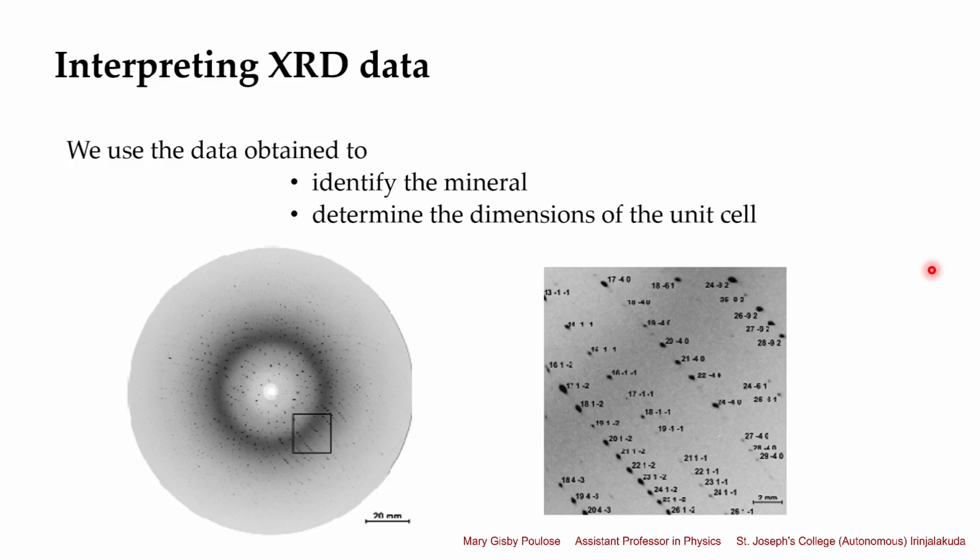XRD has been helpful in a lot of ways for researchers to develop. This is one of the non-destructive techniques. In the rotating crystal method, we take the crystal itself to study it, and it can be used as a non-destructive testing method. That's all for today. Thank you.